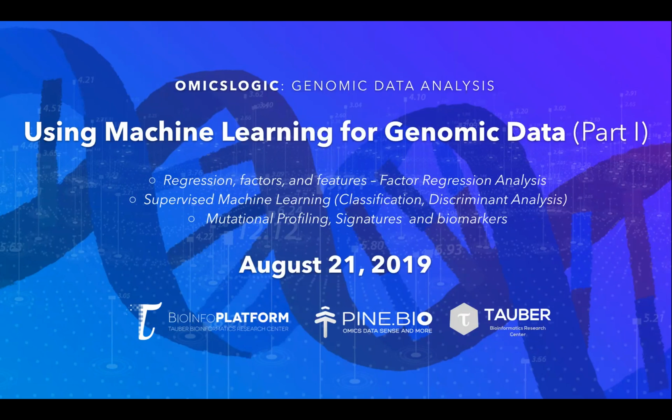So up until this point, we have been dealing with processing or preparing that data for our ability to analyze it. And as we said, that will include the pre-processing steps, the mapping, the annotation, for example, annotation by gene or annotation by type, and then preparing essentially a table. But once you have that table, then you're able to deploy some of these more complex machine learning techniques that could be supervised or unsupervised.